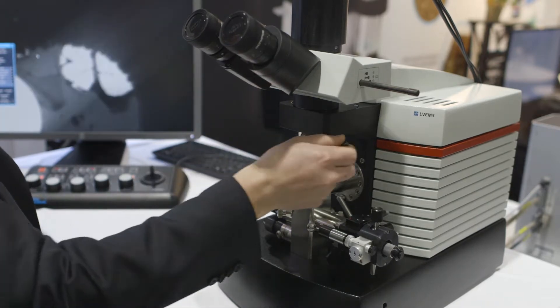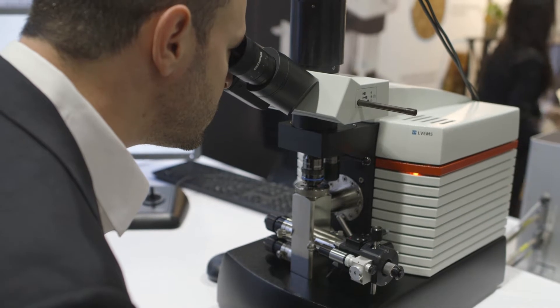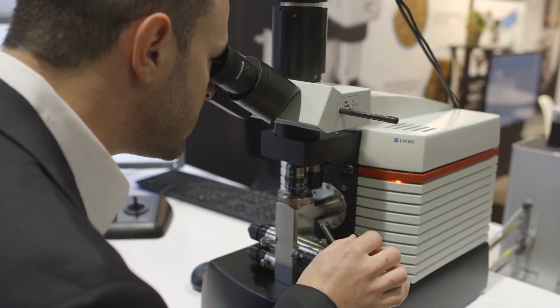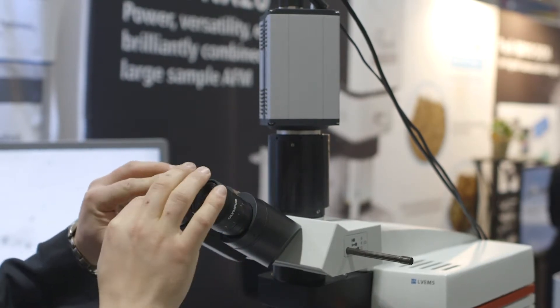Consistent with other LVEM microscopes, the LVM5 is incredibly easy to own and operate. These instruments are designed for even non-microscopists to be able to come and get deep, meaningful results from their samples without any prior experience in electron microscopy.